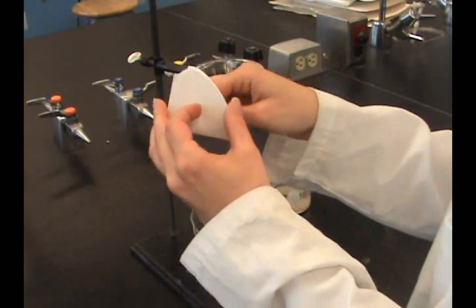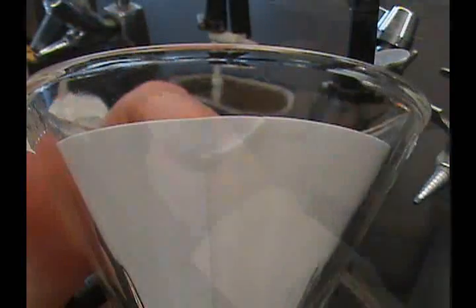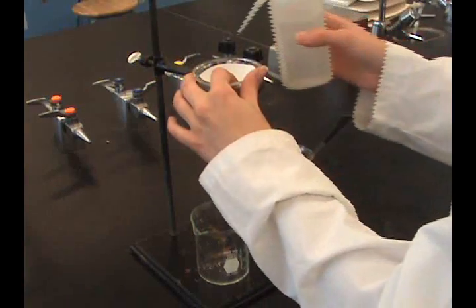Tear off a small portion of the corner to allow a tight fit between the funnel and paper. Place the cone into the funnel and moisten with some solvent.